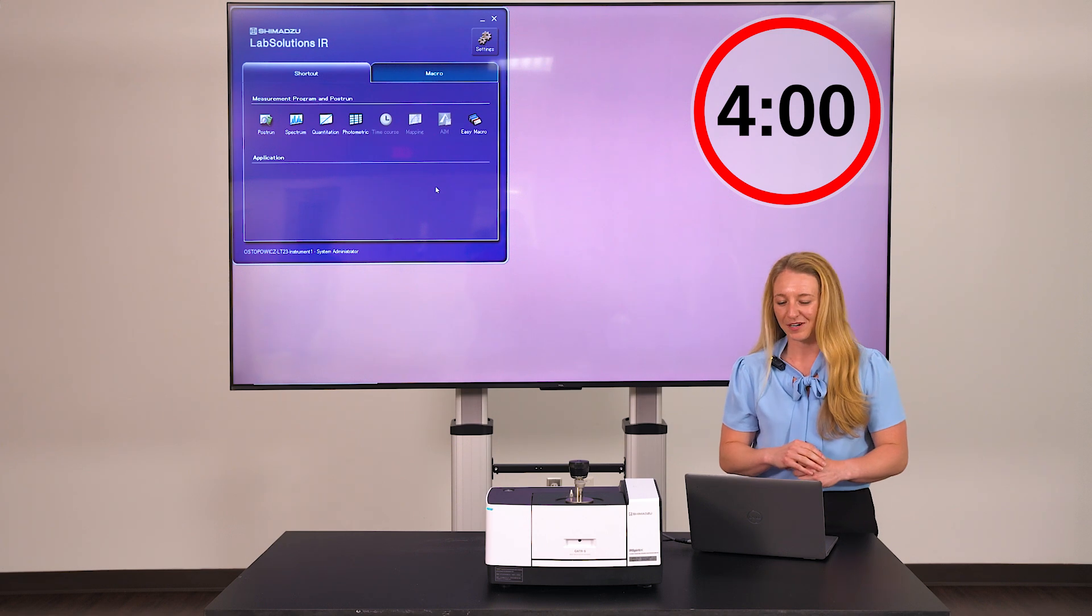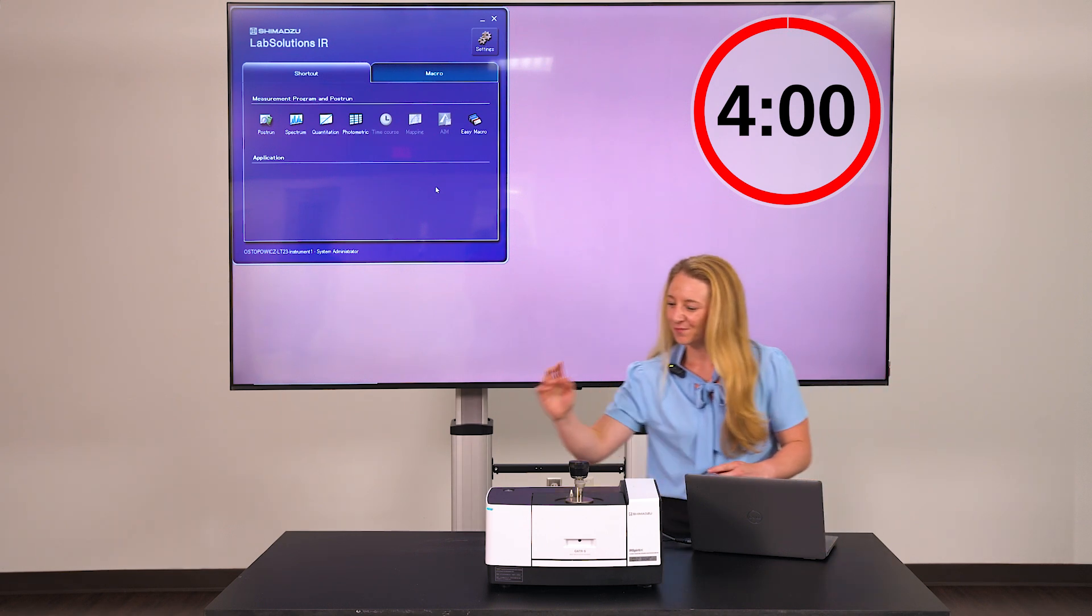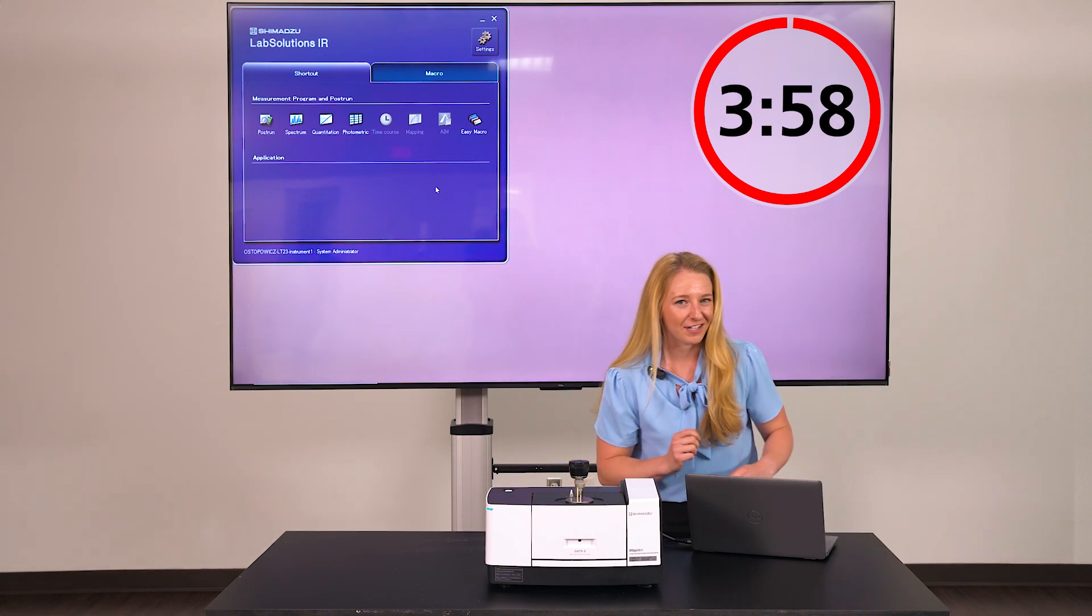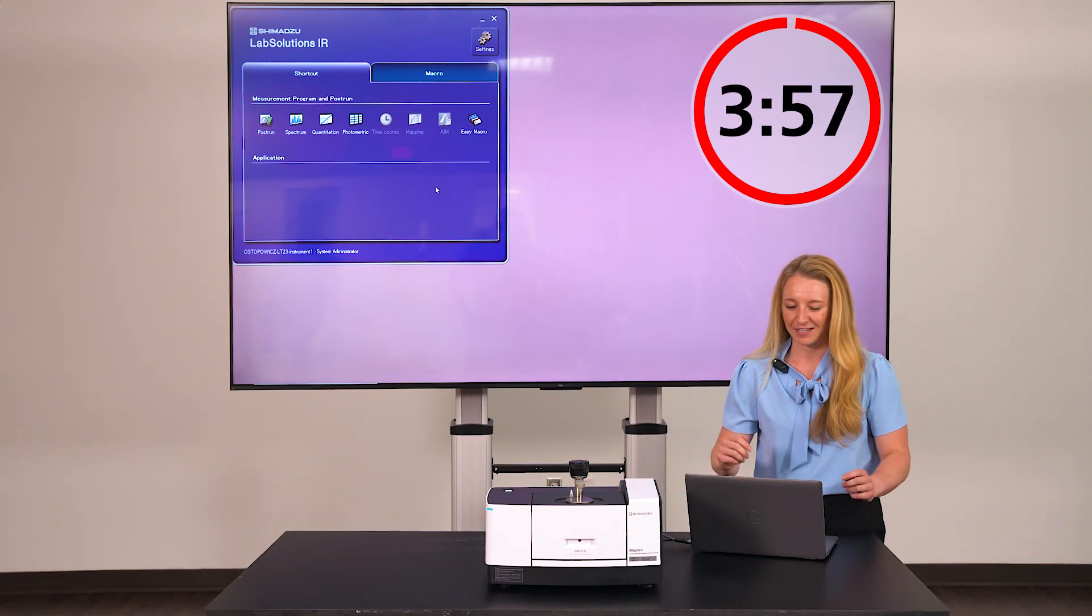Three, two, one, go. Start by powering on the unit by pressing the button in the back.